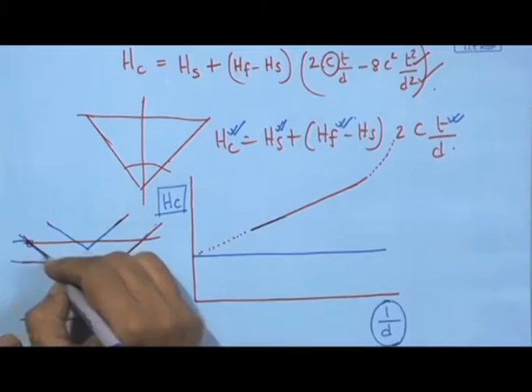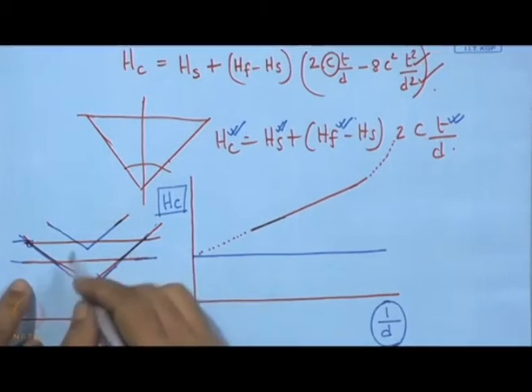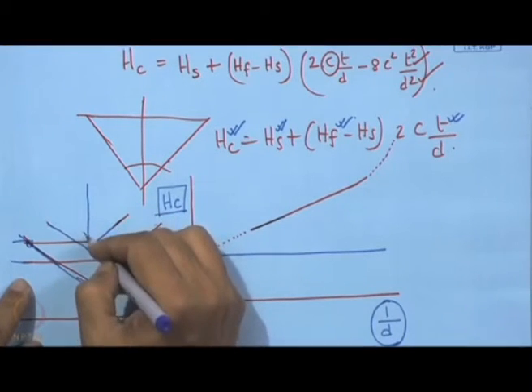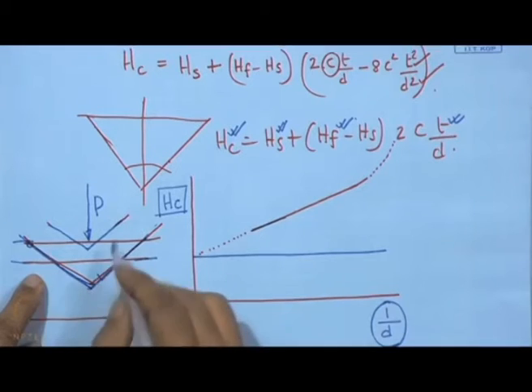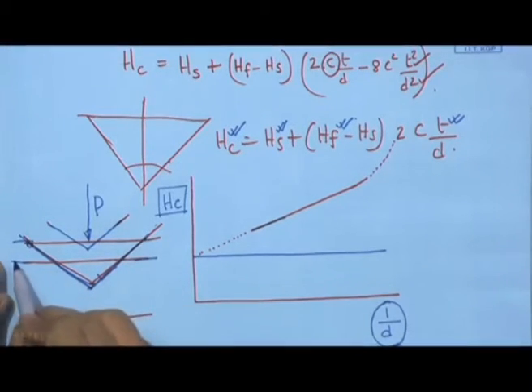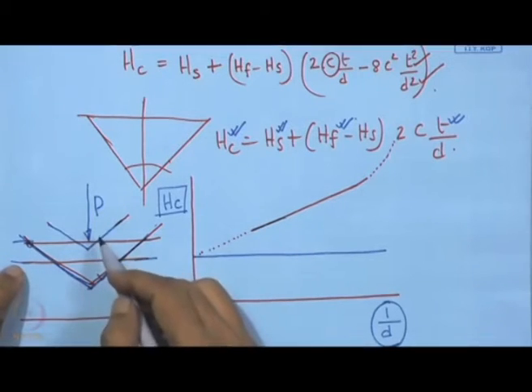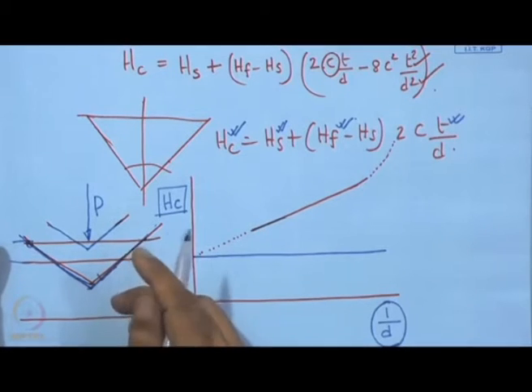This can be physically also represented here. That means, this is the area which is the load bearing area for this load which is applied here, and this is actually the load bearing area on the substrate. So, with a thin coating, with this applied load, naturally the load bearing area will be higher in proportion.